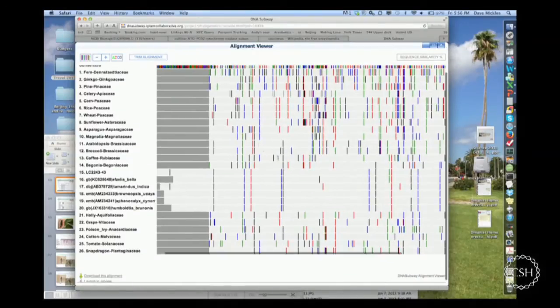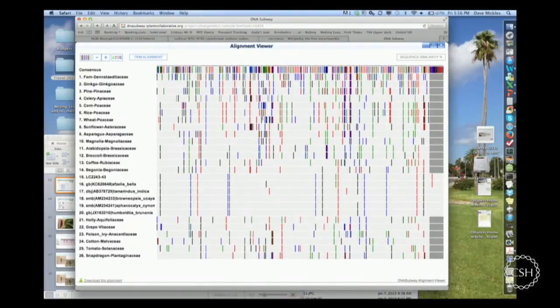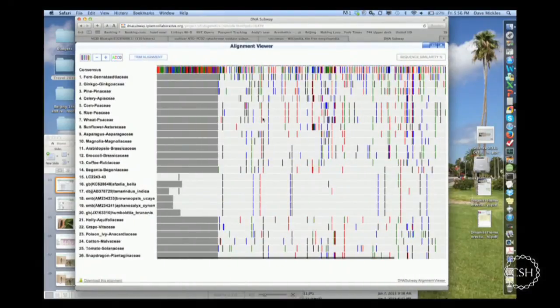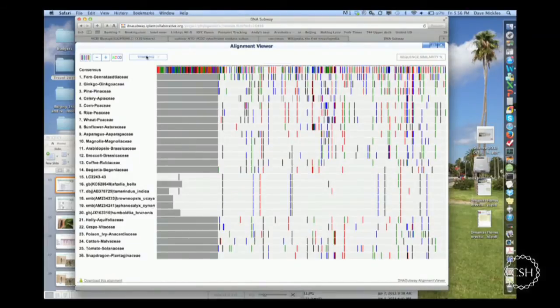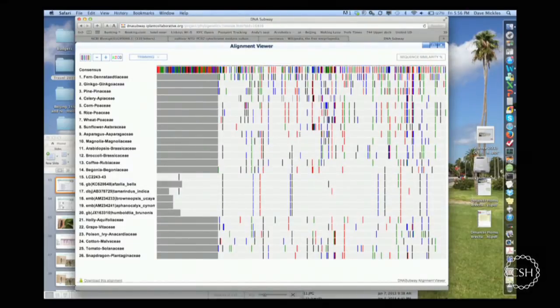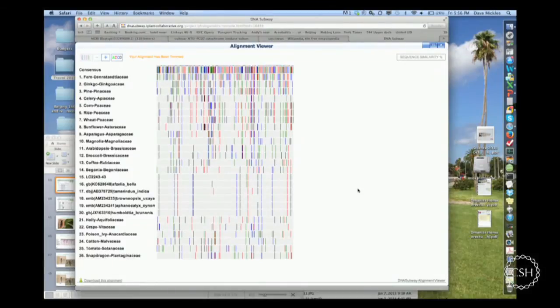To build a tree, you've got to trim out these blank ends, these unmatched, unpaired ends at the beginning and the end. And we have another trimmer that's going to do that job. So notice you trim at different times. Sometimes you have to trim more because occasionally you'll get sequences that have gray boxes in the middle, which means something's not aligning and you have to throw that out. So let me expand this a bit.